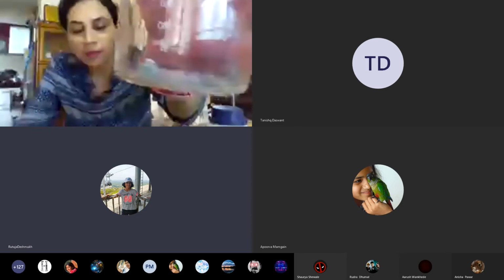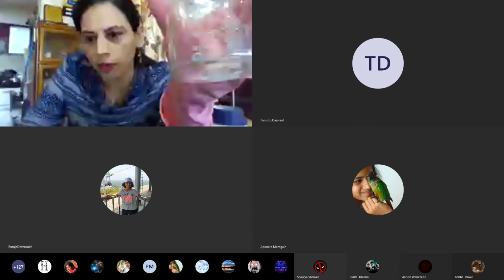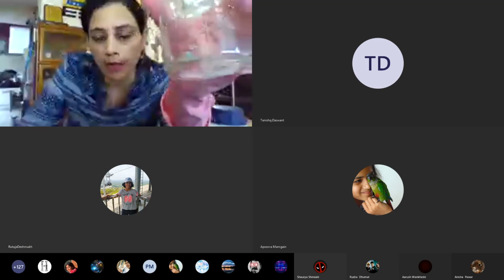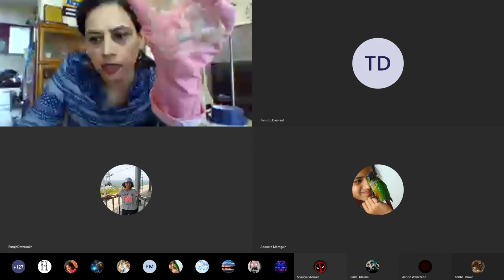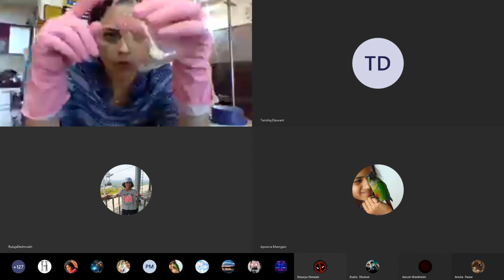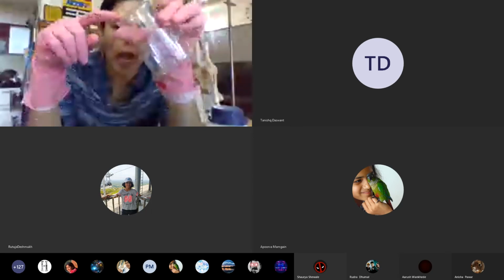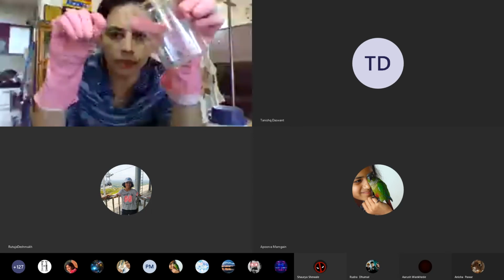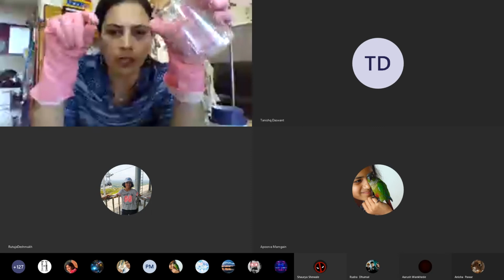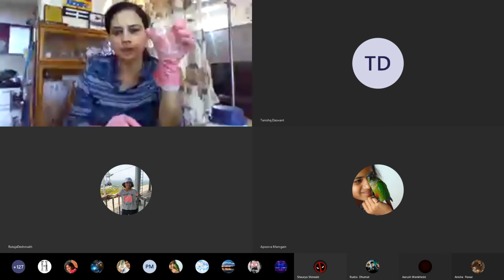Yes. Now I don't have pH paper at home, otherwise I would have shown you. When I put red litmus paper inside this sodium oxide, right now I have a little sodium oxide formed inside this beaker, if I put the red litmus paper, it will turn blue. Okay.